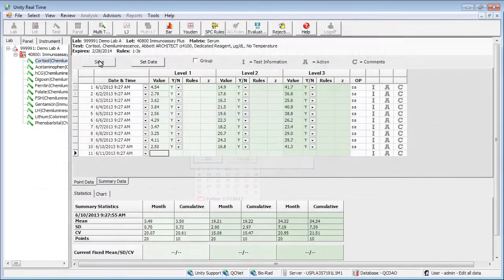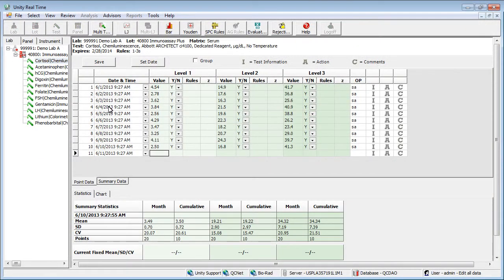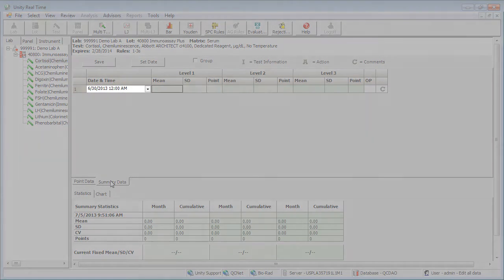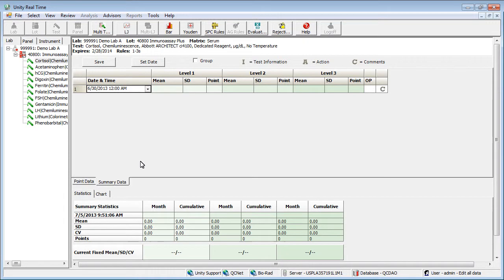Select the Summary Data tab. Begin by selecting the date. Enter the mean, SD, and number of points.